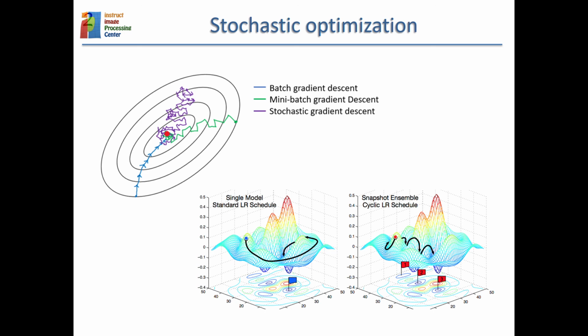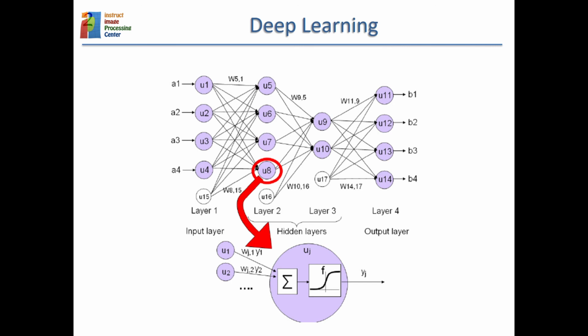There have been several advances that have made deep learning rocket in the last years. The first one is that you need a lot of data to train the network, but in cryo-EM we are lucky that we have a lot of data. Then this also requires a lot of computation, and that is why we need GPUs, which are much faster to do this kind of computation.